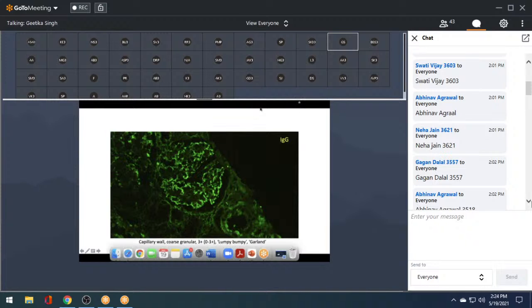And this is, again, an image that you've seen in some detail in the morning. So I have to tell you which antibody stain this is, because they're all going to look the same. They're all going to look green, right? They're all FITC-labeled antibodies at the end of the day.